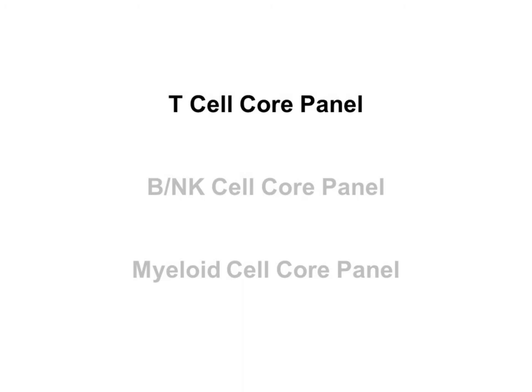In the context of this core panel design, we have set up three panels: one for T cells, one for B and NK cells, and one for the myeloid cells. And today I will mostly focus on the T cell panel.